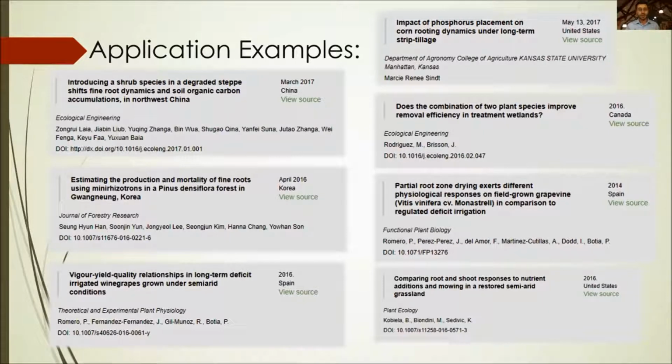So being able to use a fairly simple idea, scanning these roots at different depths, in a quicker, faster way with a better way of handling the data, enables a lot more studies and a lot more work to be done in whatever field you're looking to do it in.